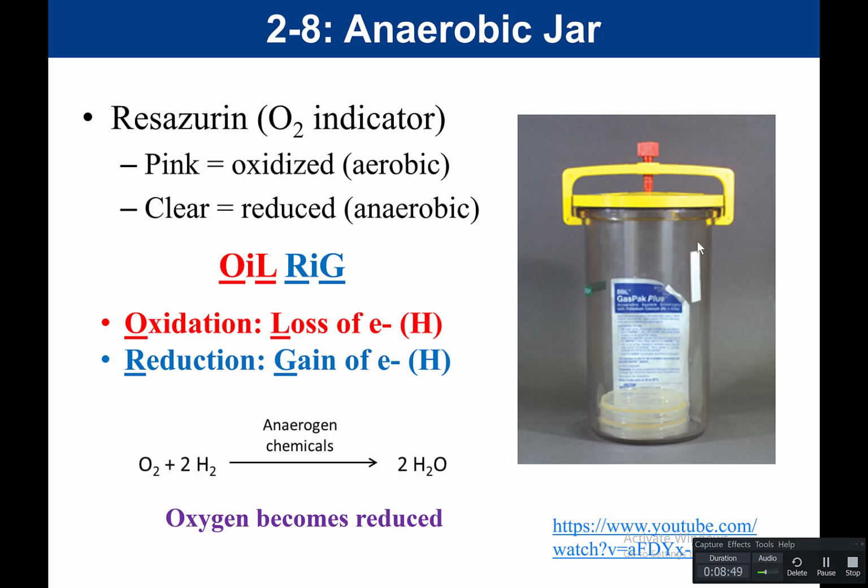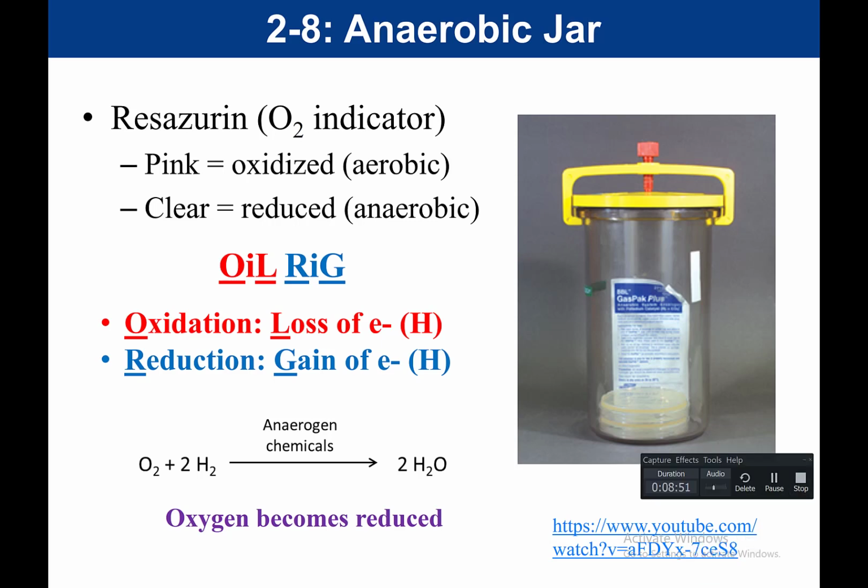So what I have down below is a link for a video, and I will include this on our Canvas page right underneath this video. Basically it's just going to demonstrate and show you how we would put this jar together. It's not my video, so I don't want to include it within my PowerPoint, but I will link it in Canvas so that you can watch that to see how this is actually set up as well.